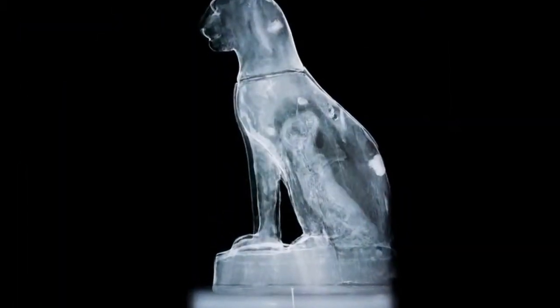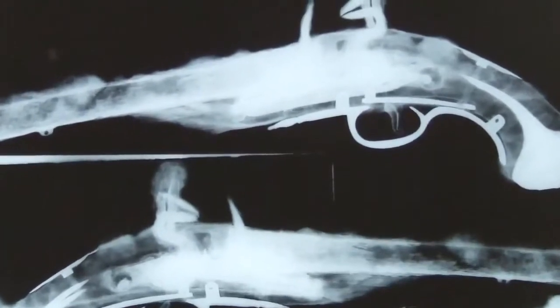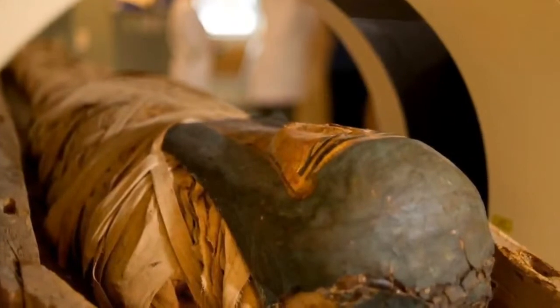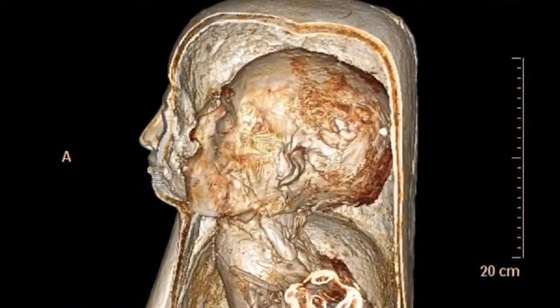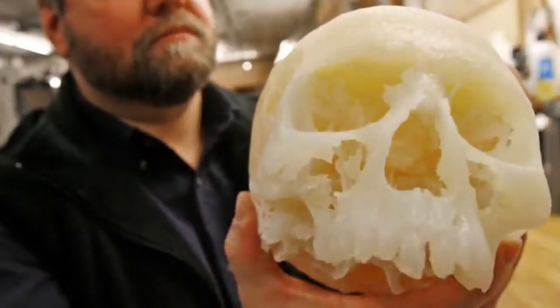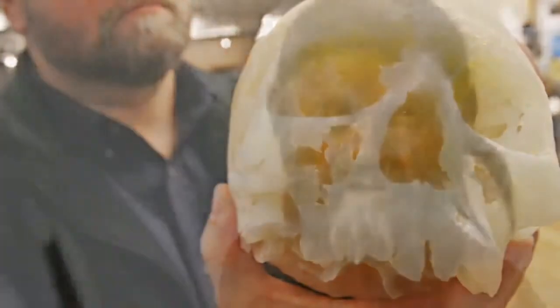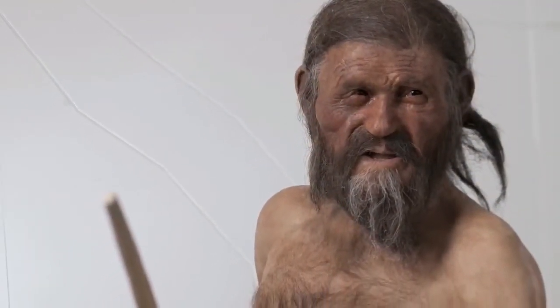They're very useful for examining the contents of an object or how it's been put together. X-rays can see beyond plumes of rust to the original form of objects within. And CT scans, or X-rays from multiple angles, are even more useful. When examining mummies, for example, we can have a look at it inside the sarcophagus without ever touching it. CT scans can even be used to sculpt a copy of a person's skull, and based upon this copy, we can create a reconstruction of their face, all through the use of X-rays.